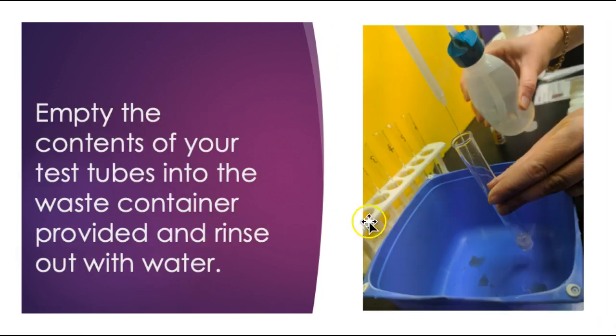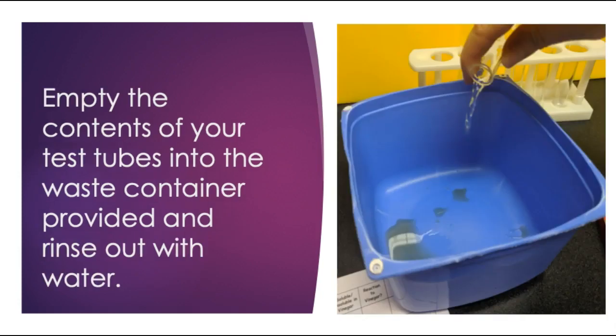Next, you have to rinse every single one of your test tubes out in your little container here thoroughly. So rinse it out at least twice to make sure it's completely clean and tip it into your waste container.